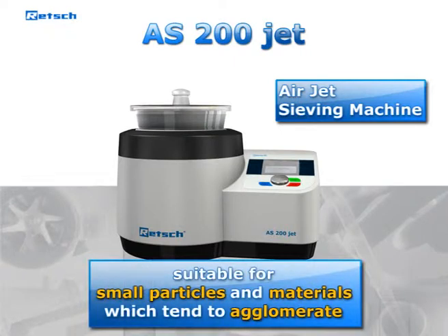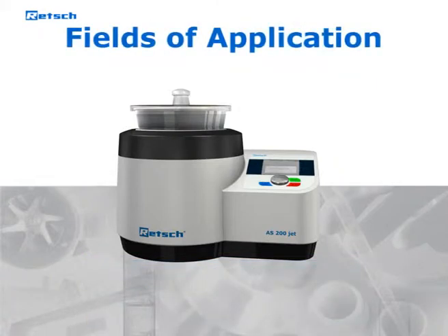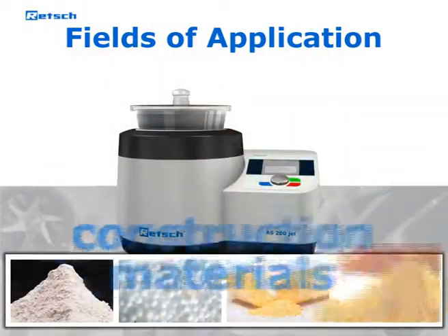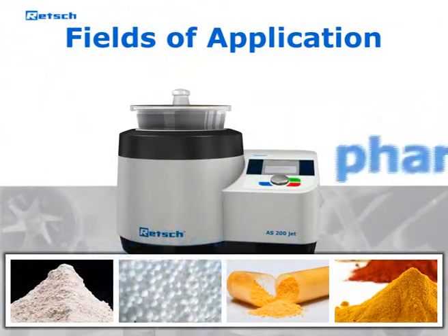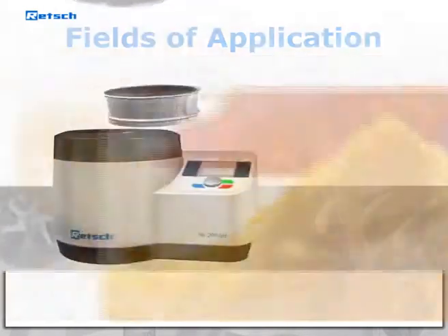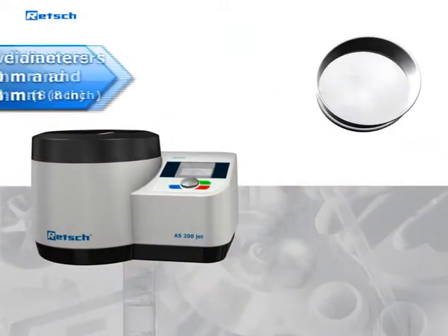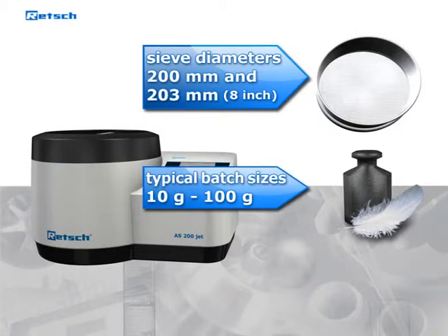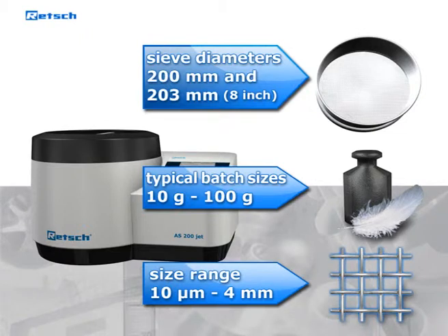The AS200 Jet is particularly suitable for small particle sizes and materials which tend to agglomerate. Therefore, the sieving machine is primarily used in the following fields of application: construction materials, especially cement, plastics, pharmaceutical products, food. The AS200 Jet works with standard sieve diameters of 200 and 203 millimeters. Typical batch sizes range from 10 grams to 100 grams. Particles in a size range of 10 micrometers to approximately 4 millimeters can be classified.